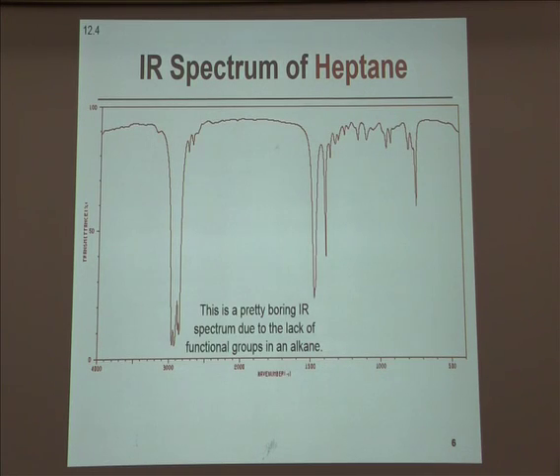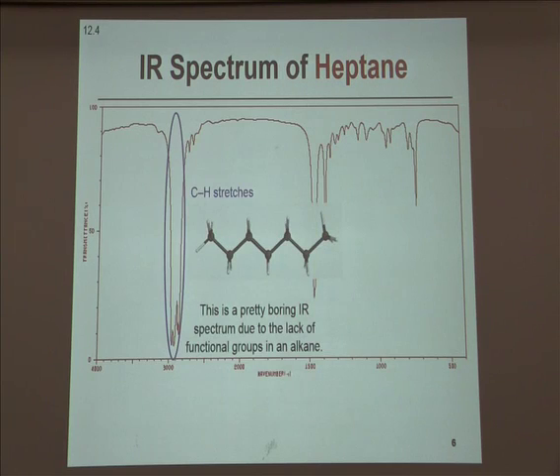This spectrum is a little bit more boring. You can see in this region over here, there's not nearly the structure we saw with the ketone on the previous slide. This is for heptane and is a simple alkane. And as a result, it has a fairly boring and pretty simple IR spectrum. On the far left, we see that similar deep feature at 3,000 wavenumbers, which corresponds to a number of different CH stretches in the molecule.